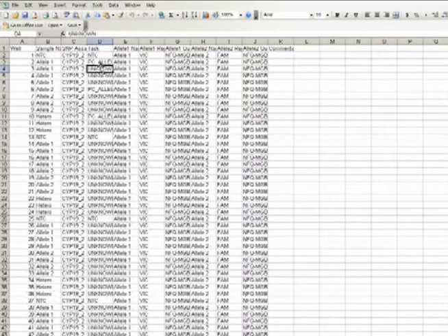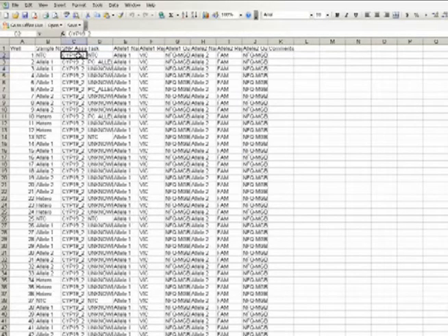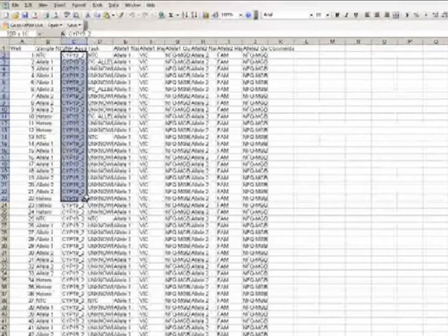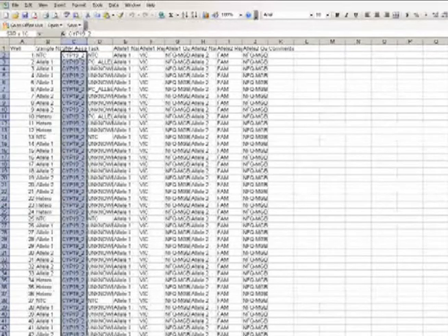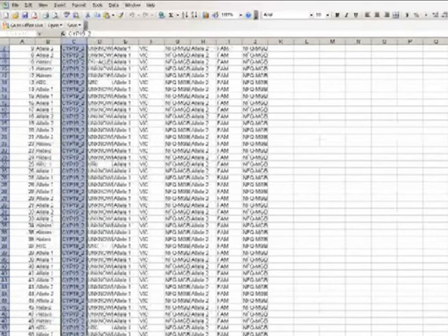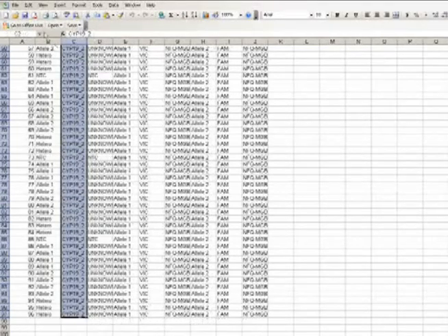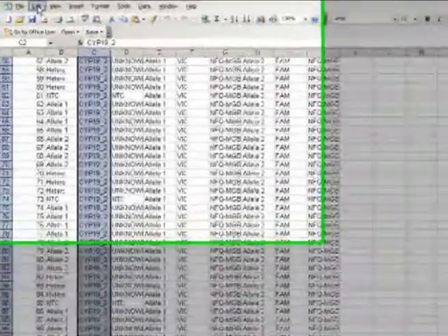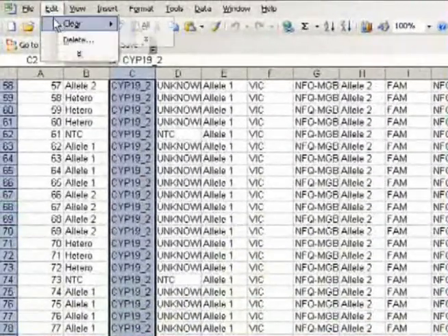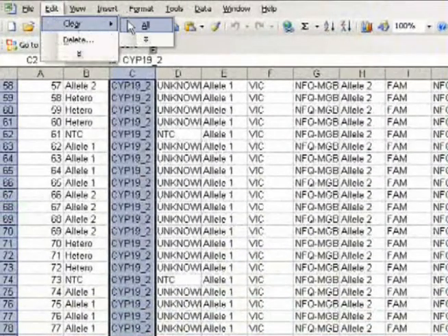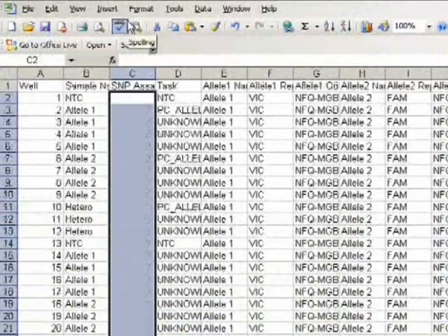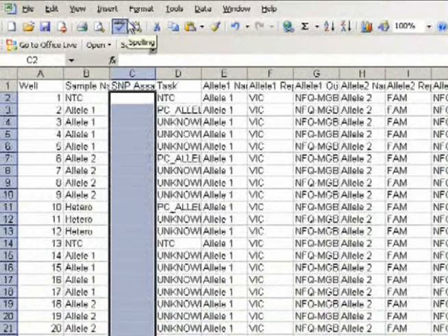I'm not going to go that far in my demonstration, but instead just select each well under the SNP assay column heading. And then, once I've got those selected, I do an Edit, Clear, All. Gone.